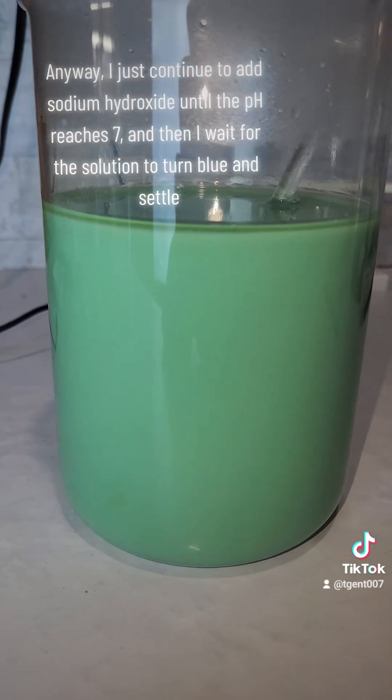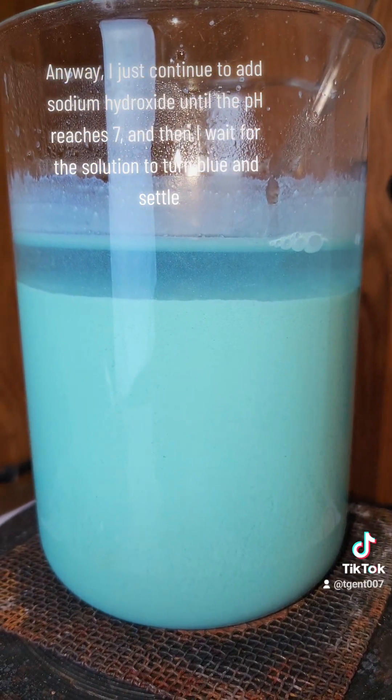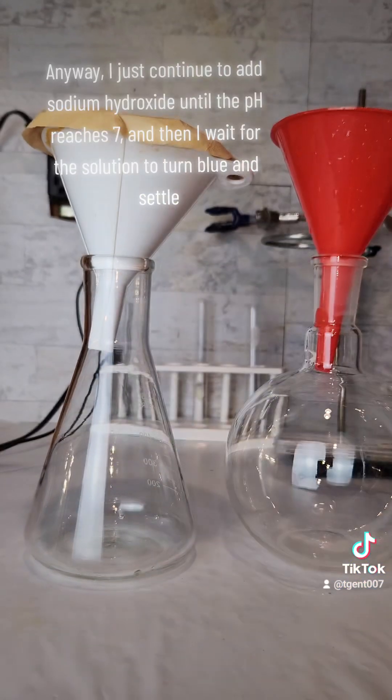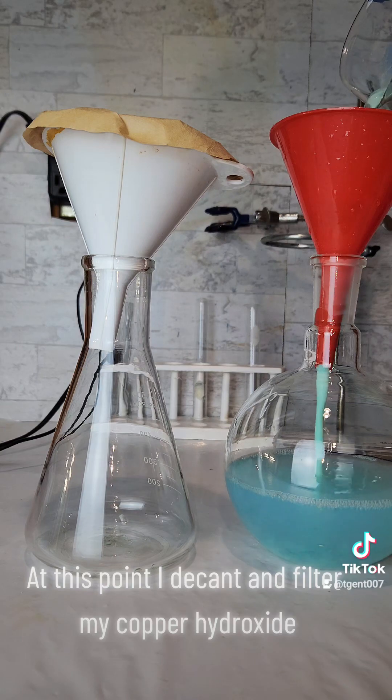I continue to add sodium hydroxide until the pH reaches 7, and then I wait for the solution to turn blue and settle. At this point, I decant and filter my copper hydroxide.